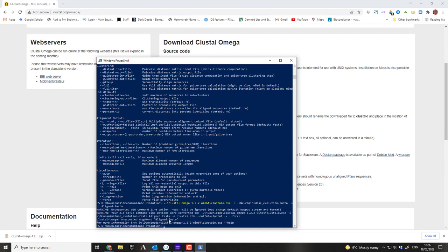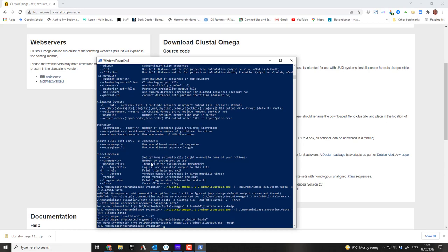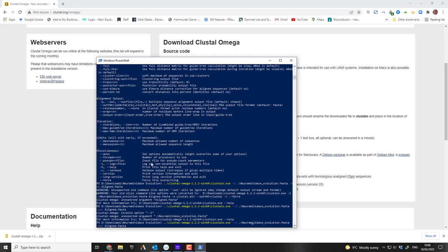What's it saying? Unexpected argument aligned.fasta. Oh, it should be minus. It should be two minuses. Oh dear. So it's --in, and then it's --out. Great. It's -i and --out.